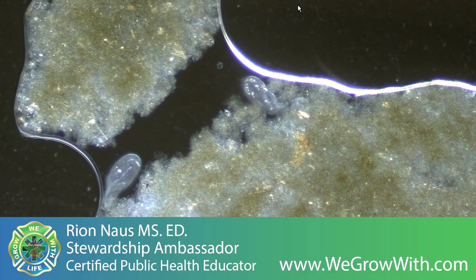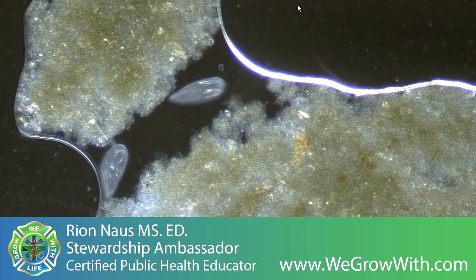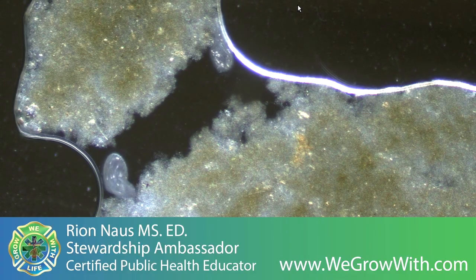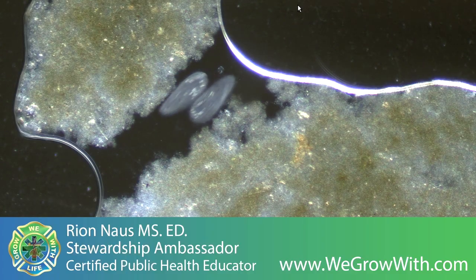The amount of work that these little creatures have done, you get a sense of how well packed and man, anything not flattened and squished, looking for any give.